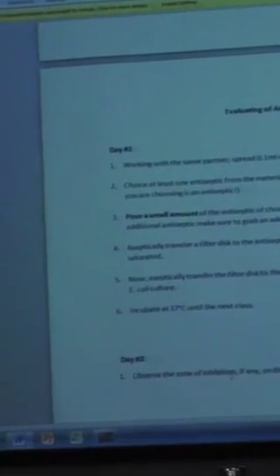You'll notice it says SL100. It holds a minimum of 10 microliters and a maximum of 100. So if you set it to 100, which should be set for you, that's the maximum volume this holds. That's 0.1 milliliters of E. coli. That's what you need.